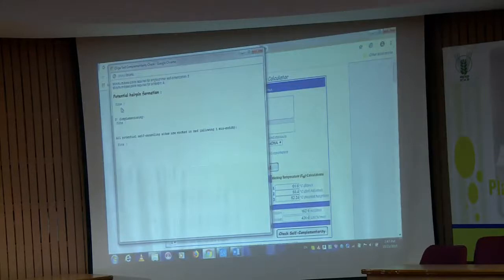So, any question regarding this, regarding primer designing, any doubts please, otherwise I will go ahead with the sequence analysis. The company people will be asking you, so what you can do is label your primer. Label means, let us suppose I have the gene sequence DNA2. How can I label it? DNA2-forward, DNA2-reverse. The orientation should be 5' to 3' for both the sequences.